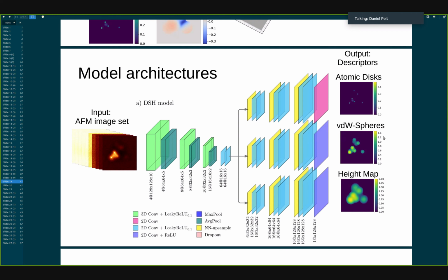Yeah, I could see that some training signal for one could help the training of the other, for example. But you could run into scaling issues, because you use mean square error, I guess. Some errors in one of the maps might be more penalized compared to the other maps.